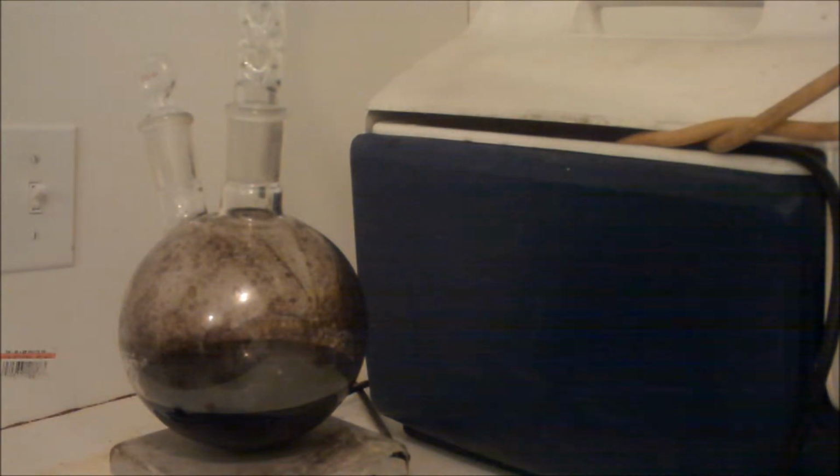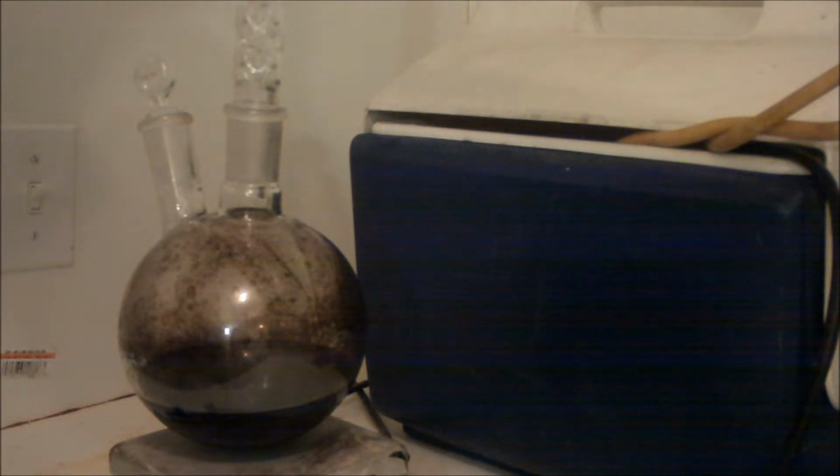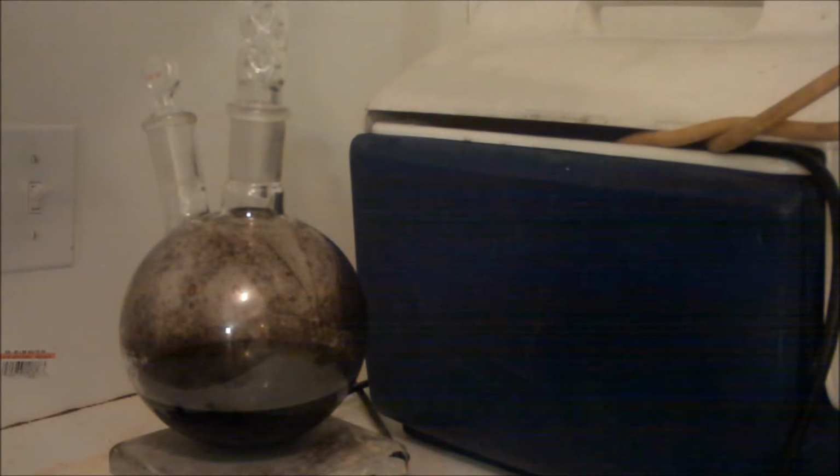Okay guys, I got the sulfuric acid inside my funnel up on top. So first of all, before we start adding acid, a word of caution: bromine is very toxic, very corrosive. You should read all the safety protocol before performing this, and be in a fume hood, as I am, or outside, or have a very well ventilated area. So I'm going to start very slowly dripping the sulfuric acid onto this solution.